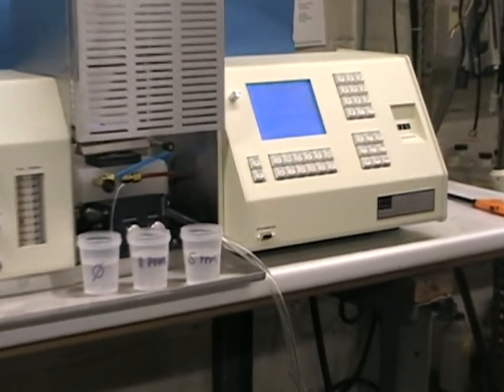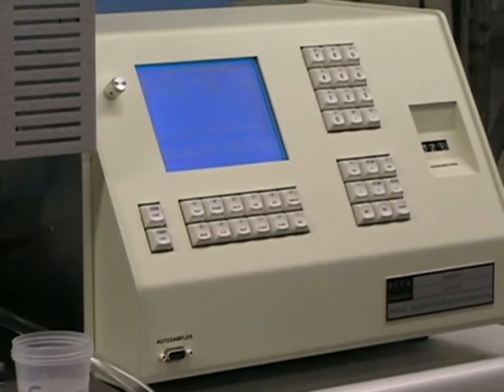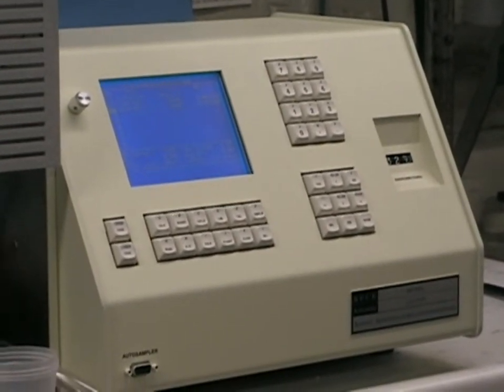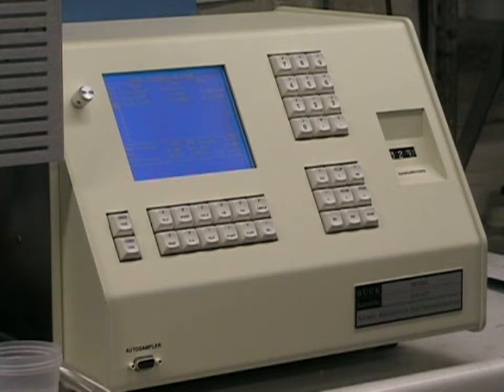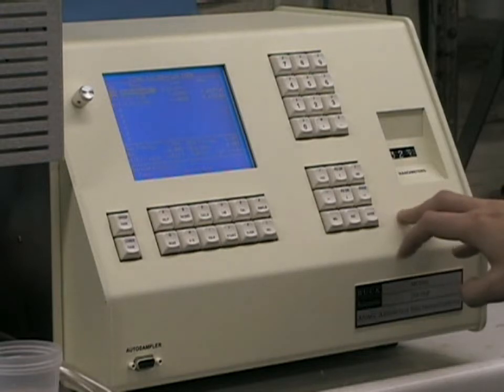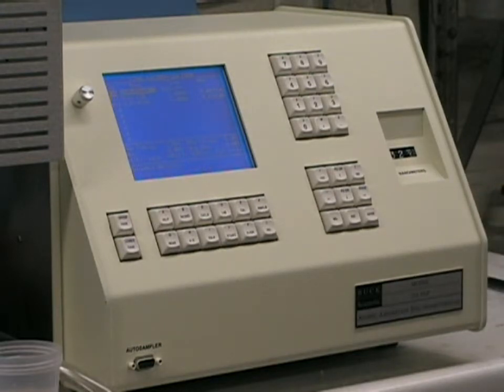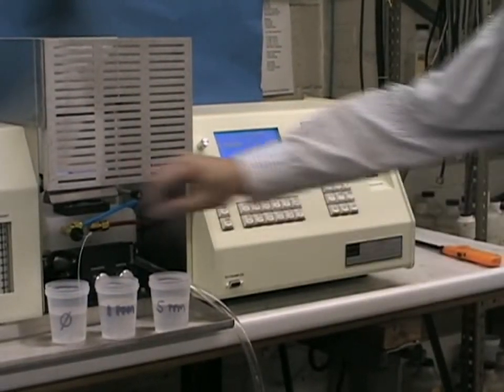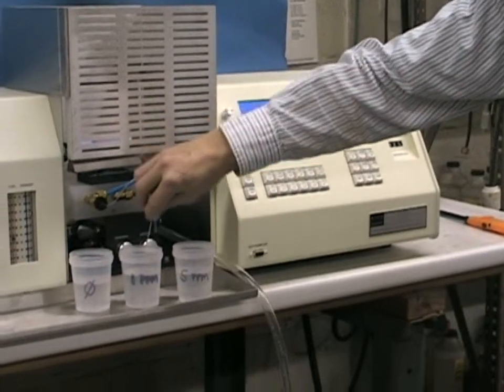By pressing the Cal key on the keyboard, we go into our calibration screen. The system is capable of storing previous analyses, so it's very easy to refresh or recalibrate on an existing curve. With your sample in the blank, press the Start button, and follow the directions on the screen. The system will auto-zero on your blank, and then prompt you to take replicate readings of your standard, as defined by your procedure.